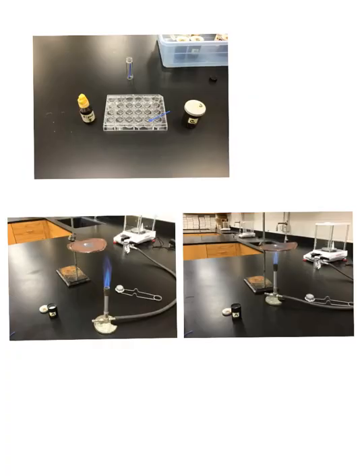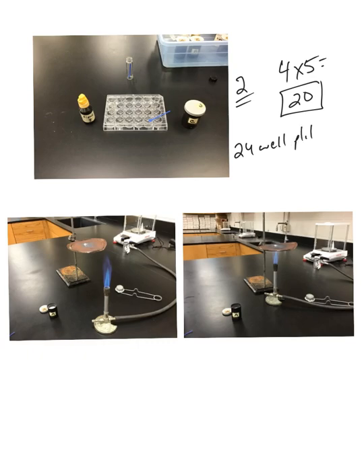Then the next part, part 2, is you're going to test each of the powders with each of the liquids. So you have 5 powders and 4 liquids, so you are going to make a total of 20 individual tests. What you see here, and if you did the lab equipment worksheet, is a 24 well plate. So you should have more than enough wells to do all 20 tests, and you can make each of the combinations.